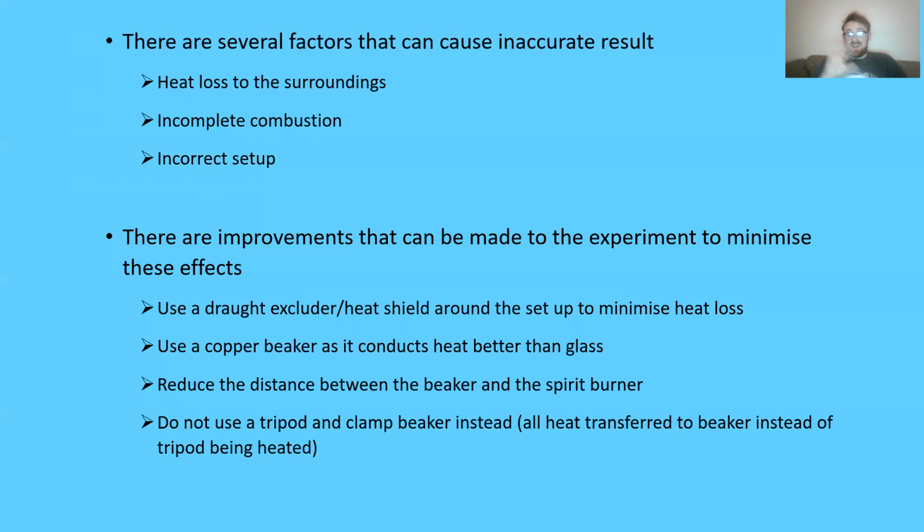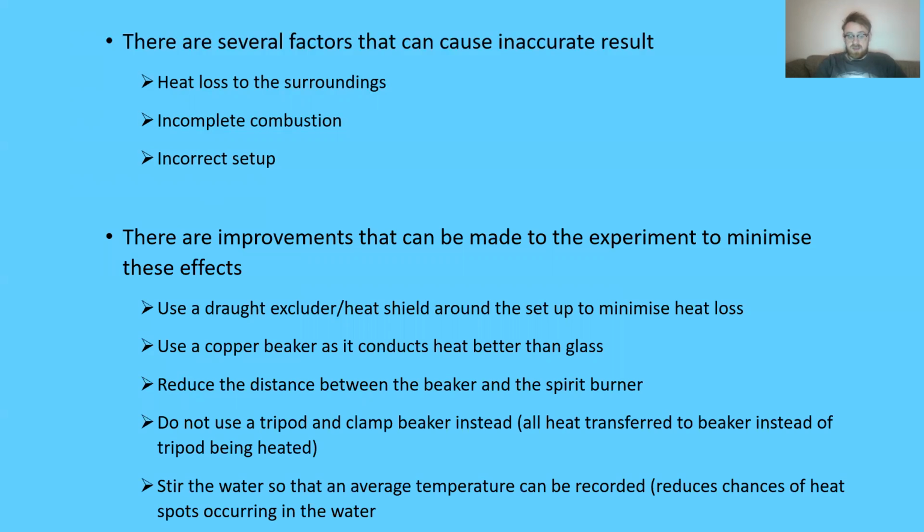Do not use a tripod and clamp the beaker instead. If you clamp the beaker, that means the energy from the fuel isn't going to go into heating up the tripod to begin with. The heat can go directly into that beaker, into the water. So that's another improvement that can be made.